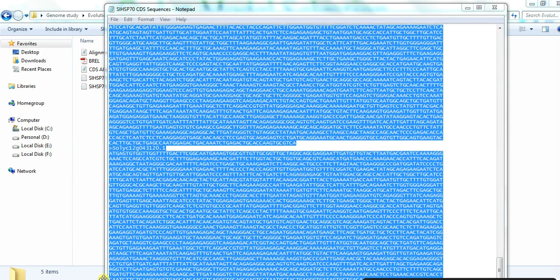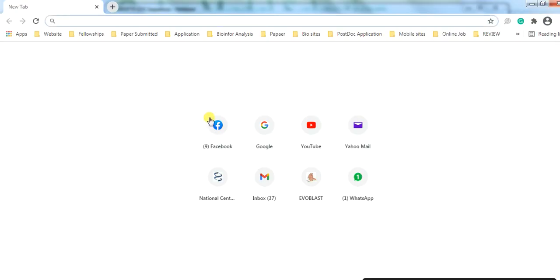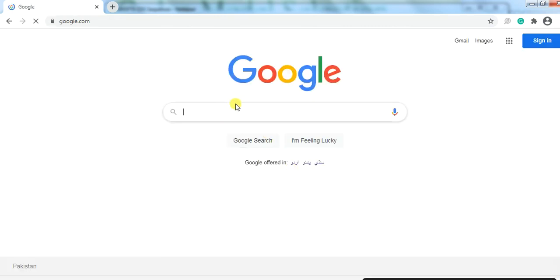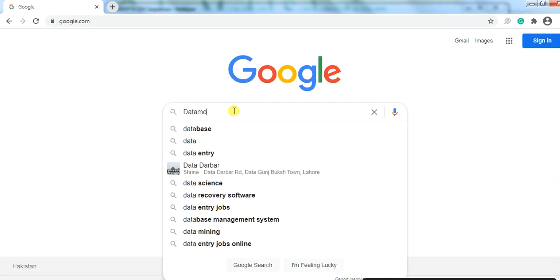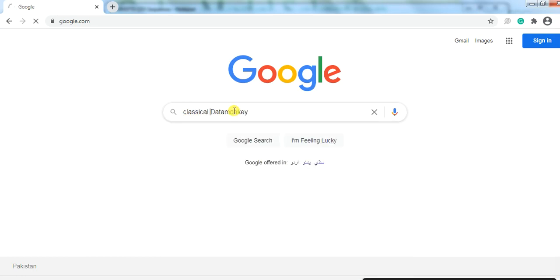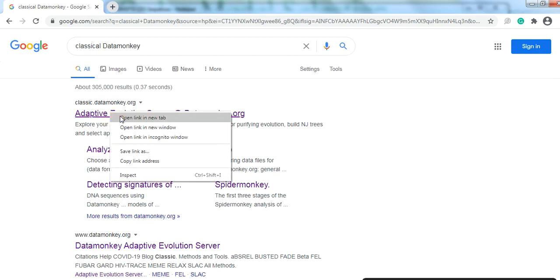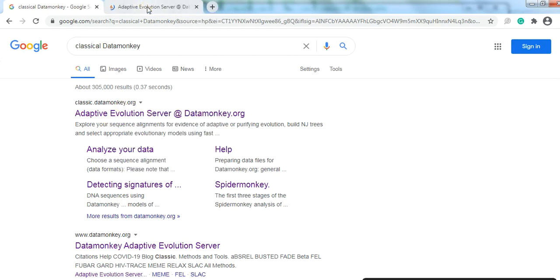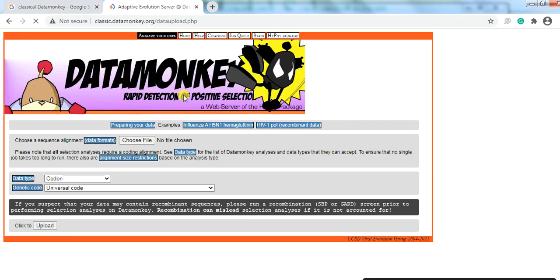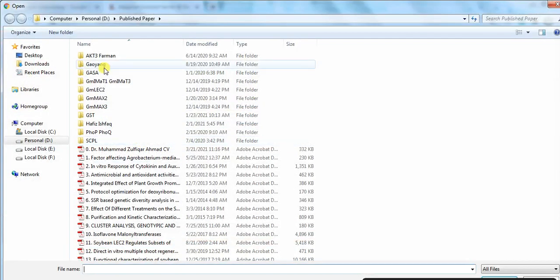Now open the Google browser and search for 'DataMonkey' or 'Classical DataMonkey'. Open it, click 'Analyze Your Data', and choose the alignment file that we just made.